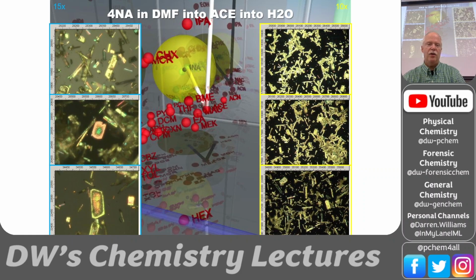And then here we're going into acetone, a polar solvent, and we're getting stabilized faces that produce plates. So here's plates. We see lots of plates. So we're changing the length to width ratio. We're changing the crystallinity of these precipitates.